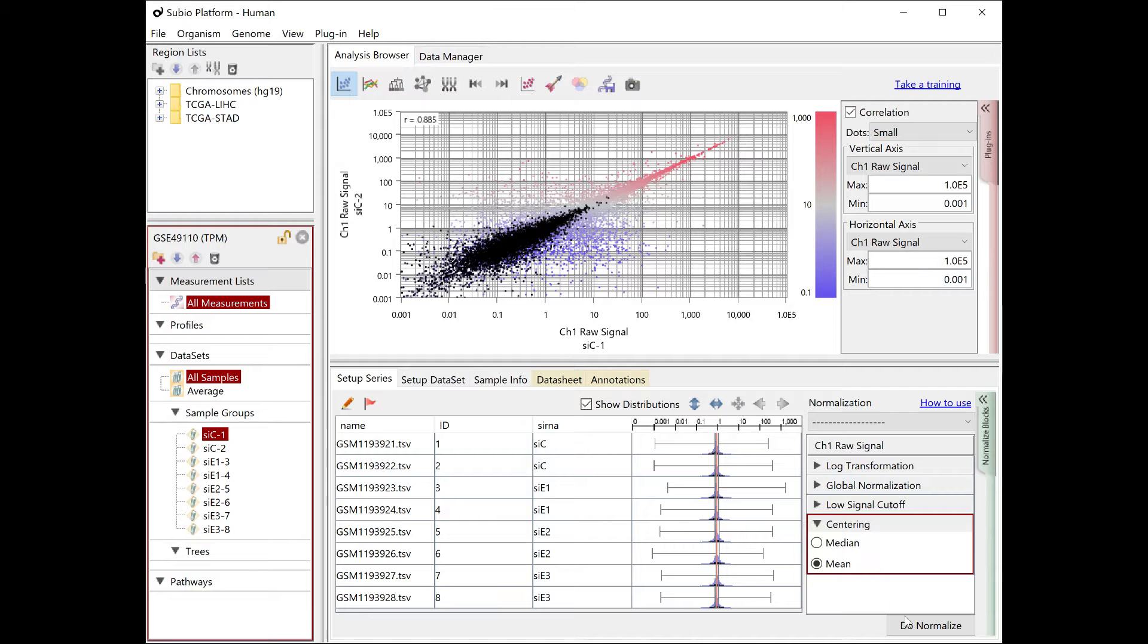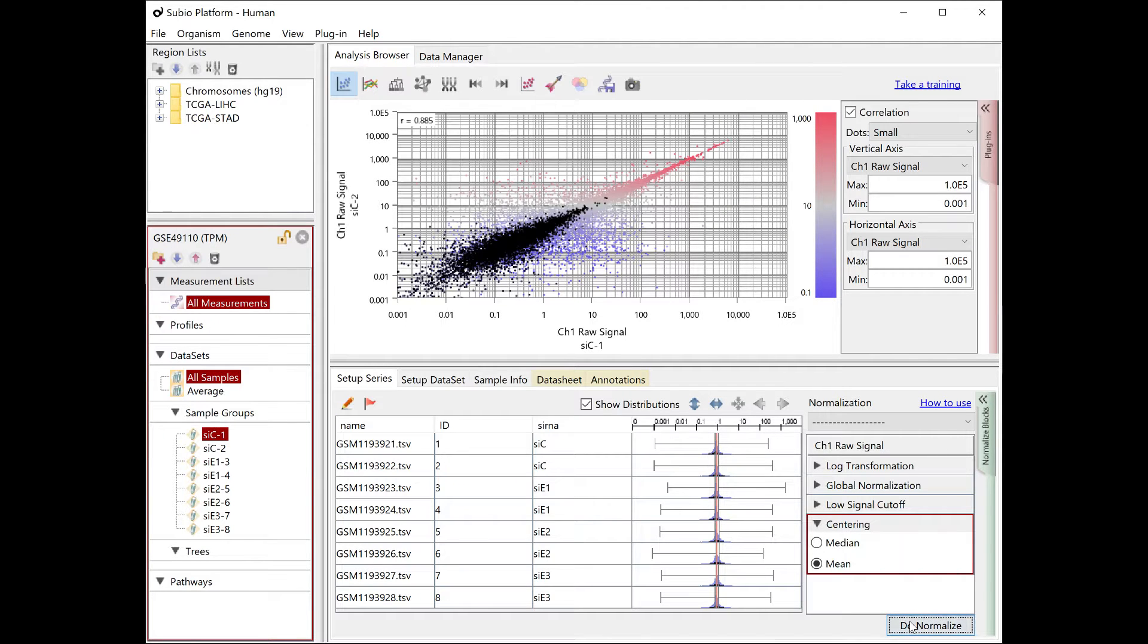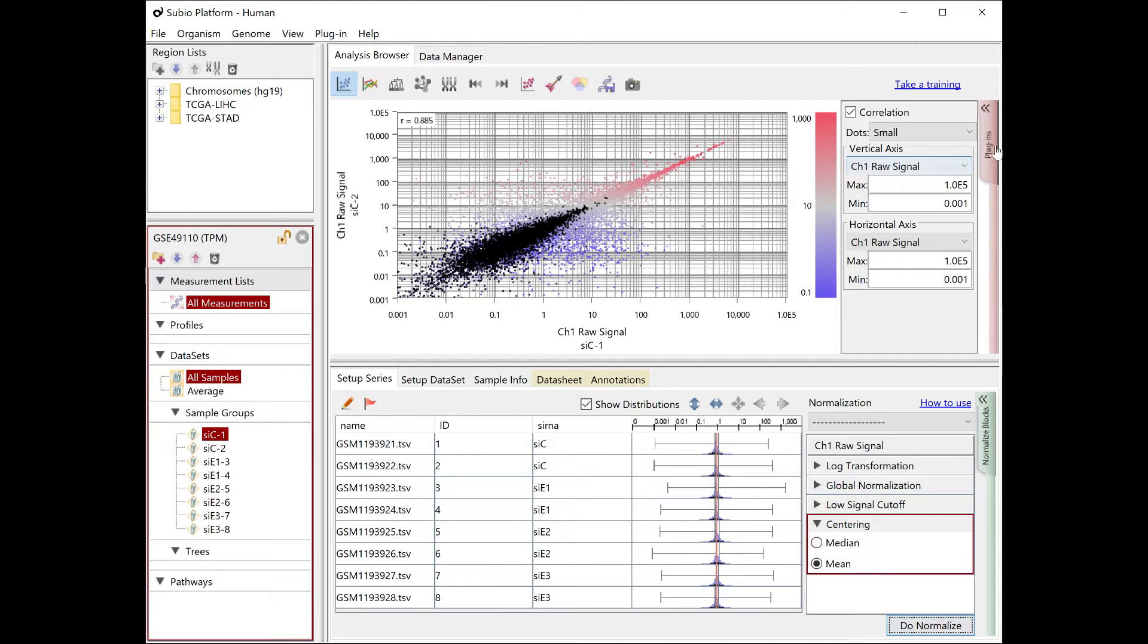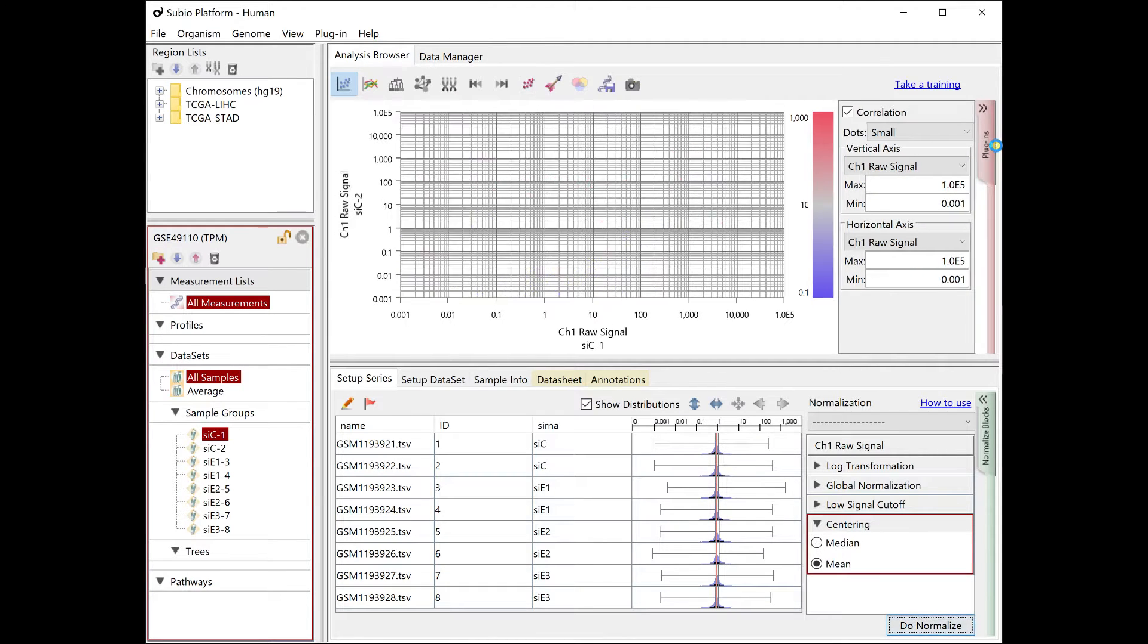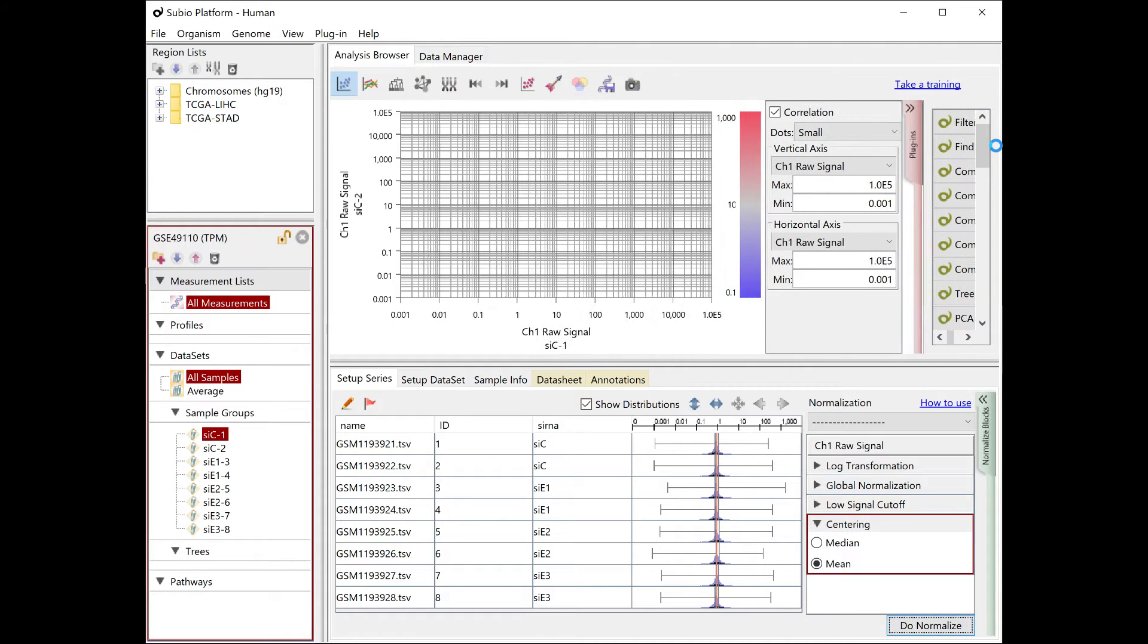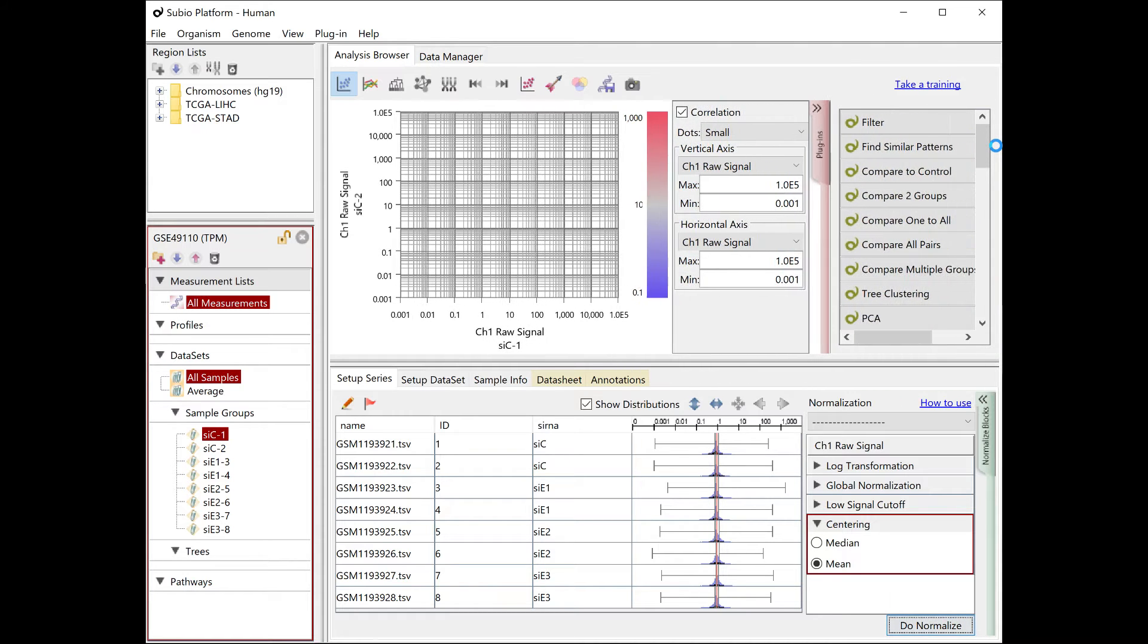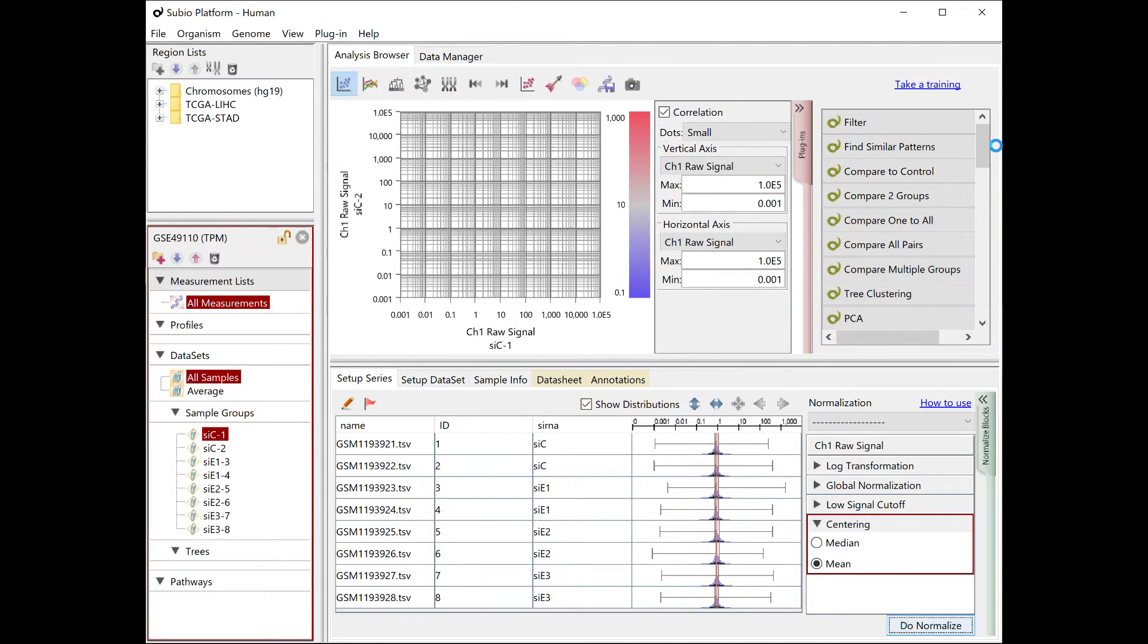Press the Do Normalize button to overwrite the processed signal to reflect the modification. As we saw earlier, this data seems to be less reliable when the TPM is lower than 0.1.